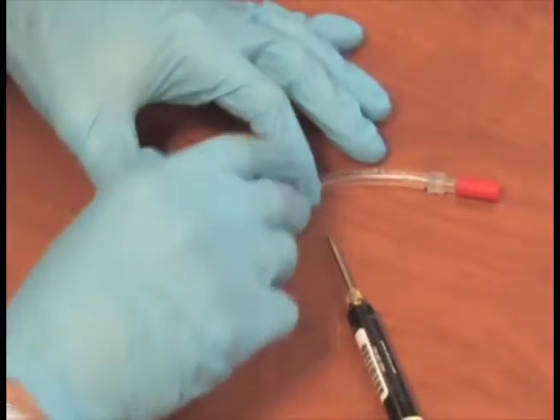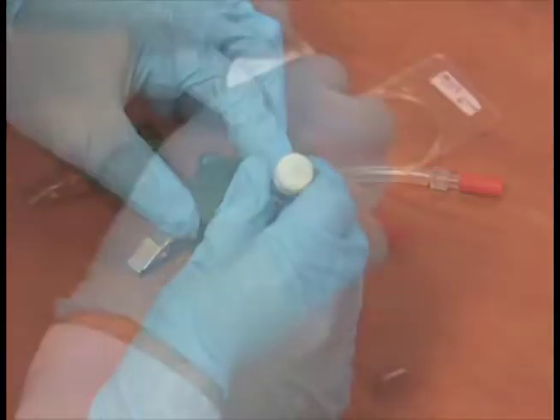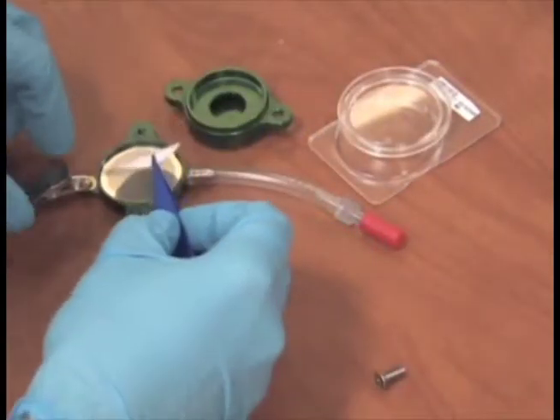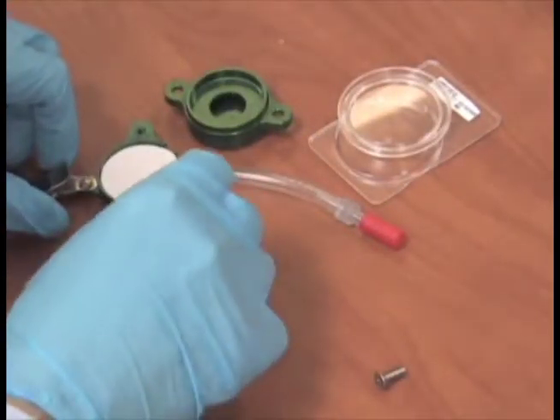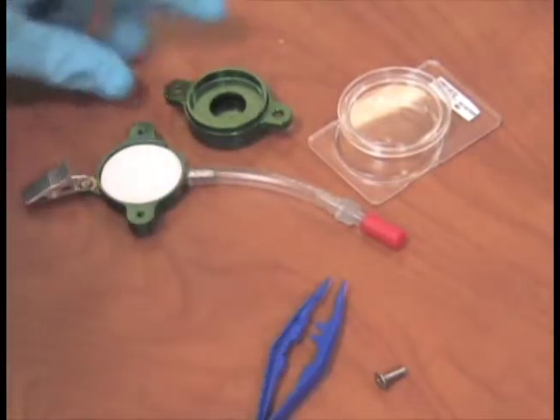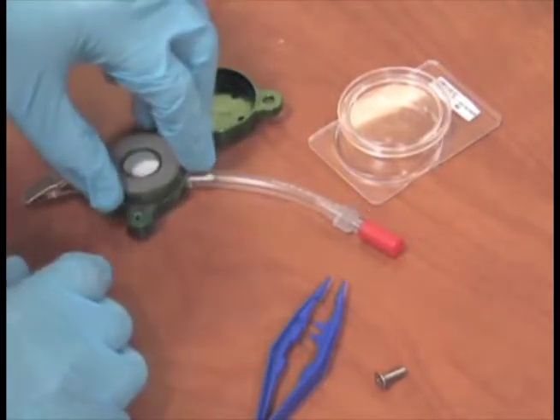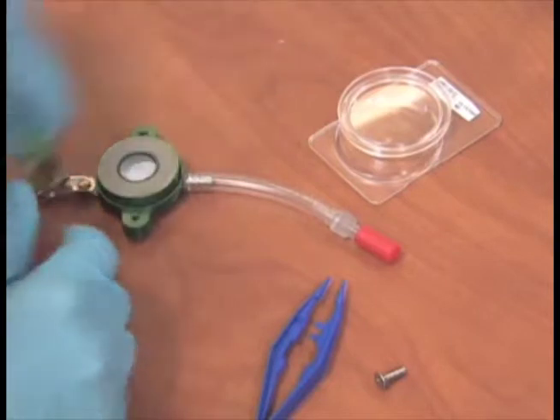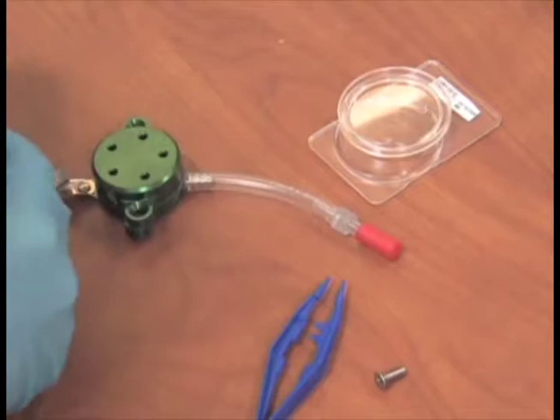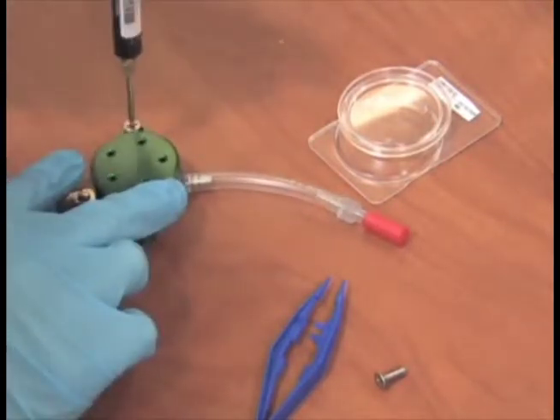Remove the transport cap from the inlet. If the PEM was not pre-loaded, unscrew the PEM and install a filter from the Petri slide using tweezers. Reinstall screws tightly.